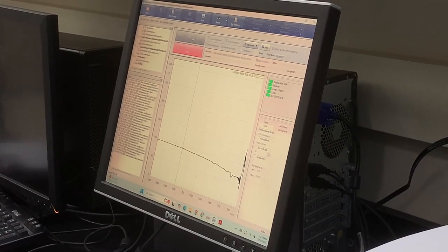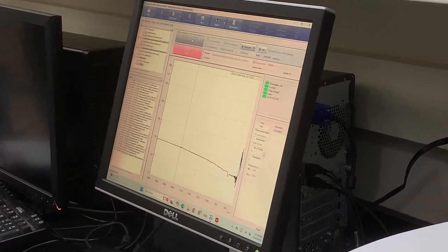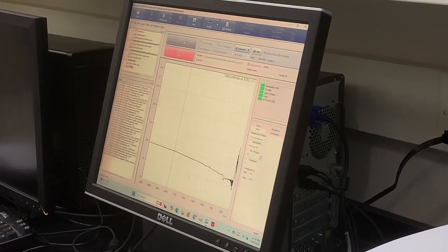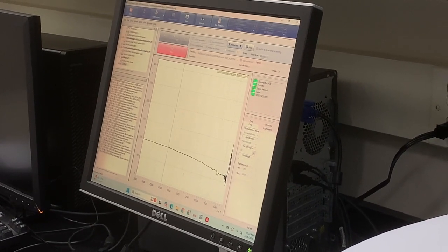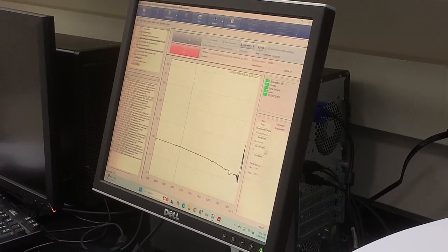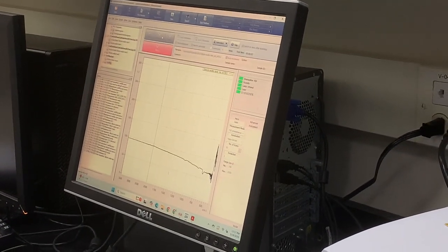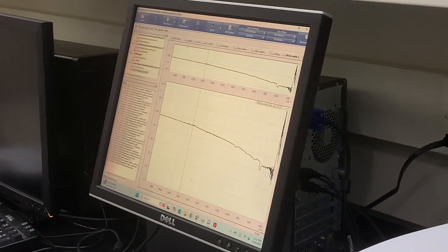Do you know from literature where you would expect to see it? Yes, I have the profile of the silicon wafer itself and the profile of the titanium dioxide on the silicon wafer. Well, that's a good starting point. Alright, 7 more seconds. 5 more seconds. It also goes around 300%, which means there are a lot of reflections coming here.